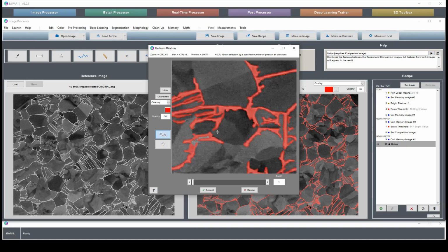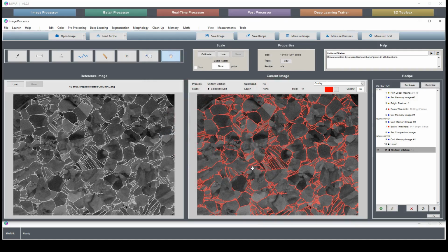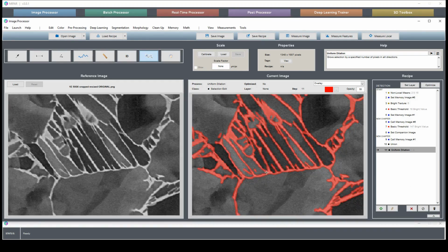But that gives us another problem. It shows us that some of this darkness around the bright beta actually gets found, and that's going to drag down our average grayscale intensity. So I have to do a little bit more pre-processing just before we can really go forward with our rejection. So how would we do this? How would we clean away this dark stuff?